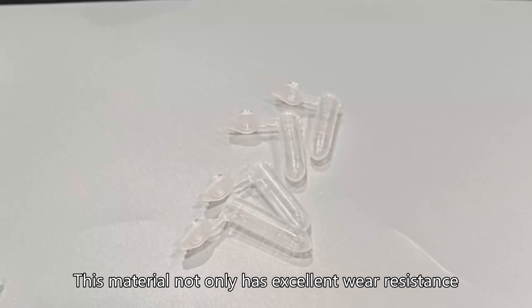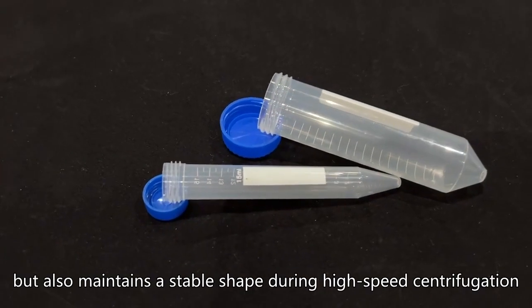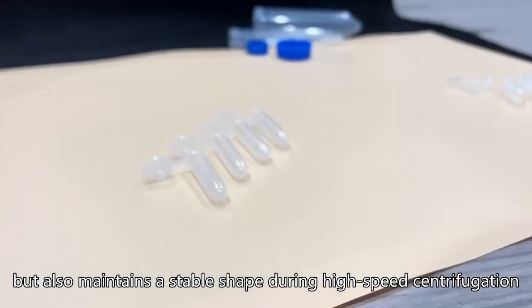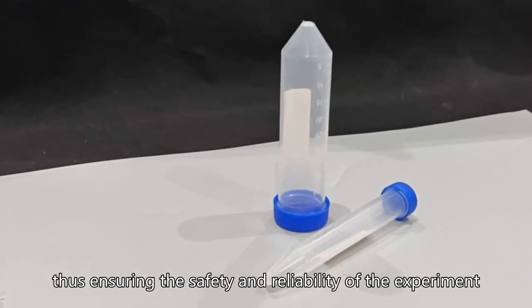This material not only has excellent wear resistance, but also maintains a stable shape during high-speed centrifugation, thus ensuring the safety and reliability of the experiment.